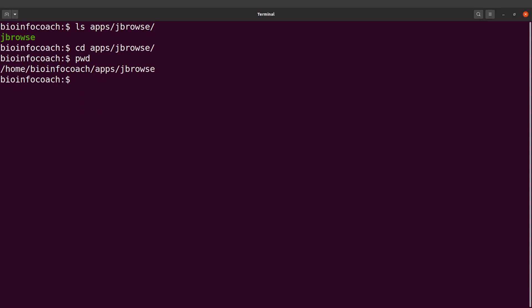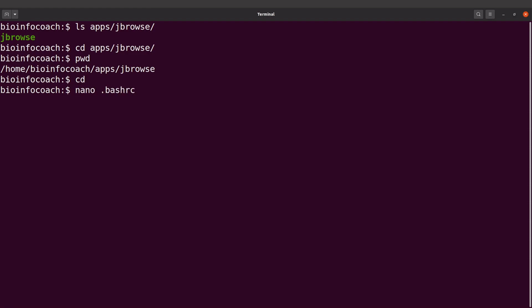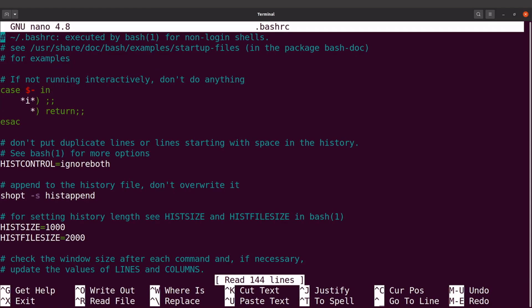I'll cd back to the home directory and then edit my .bashrc file, which is a hidden file. I'll say nano .bashrc — you can use any text editor, but this approach works for me. I'll open it and scroll to an empty space.